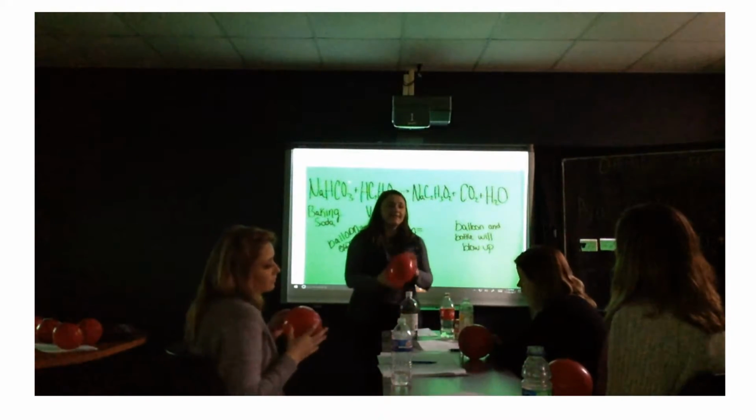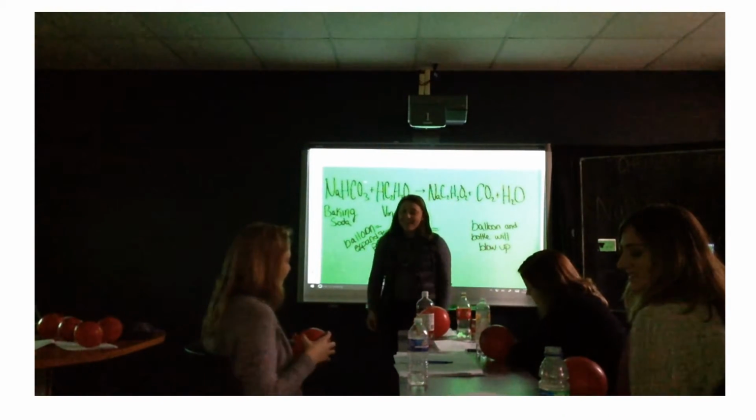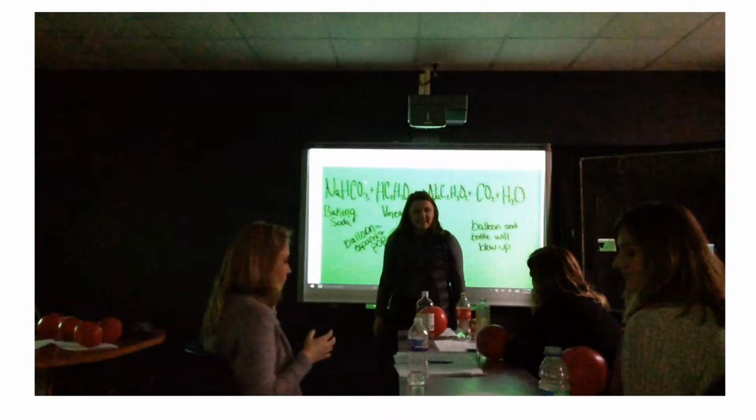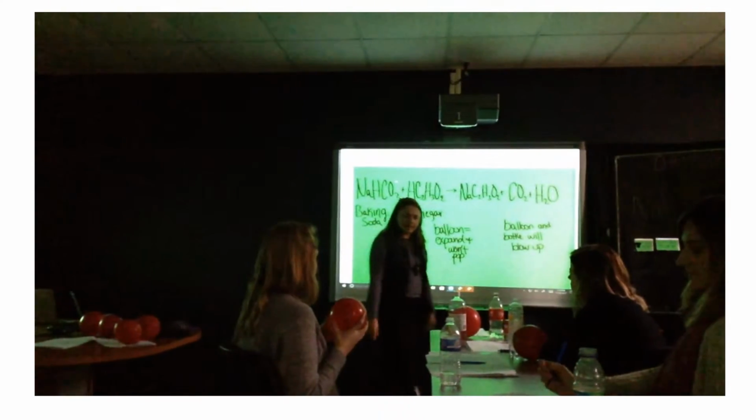So if you guys notice, we started with a solid, a liquid, and now we have a gas. So that teaches us that our reactants can turn into any state of matter after the reaction happens. They don't have to stay in the same state that they started in.